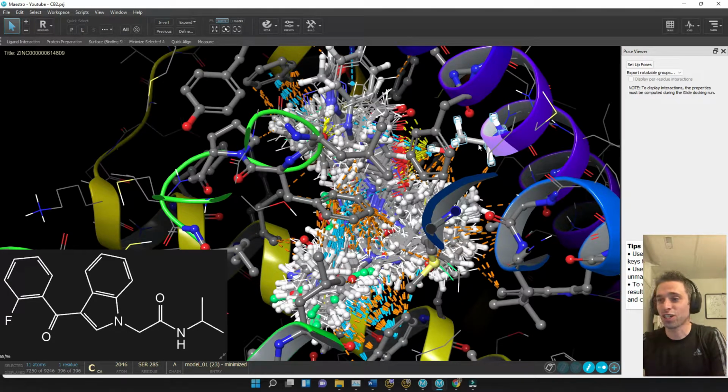So basically, if we wanted to build a really high affinity ligand, we'd want to build one that has those characteristics. I'm not actually familiar with how to do this sort of thing, particularly. So if anybody knows, I'd love to learn how to build one of these pharmacophore models and build a ligand based on those interactions. The hard part is you also have to think about how you build your ligand in a three-dimensional way that would satisfy all those criteria. That's what I'd be interested in figuring out how to do.